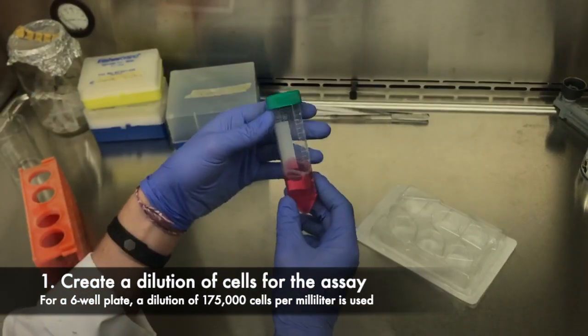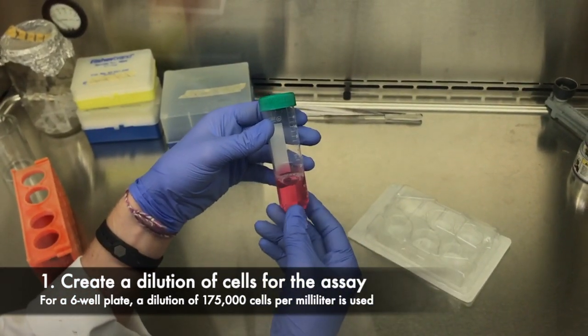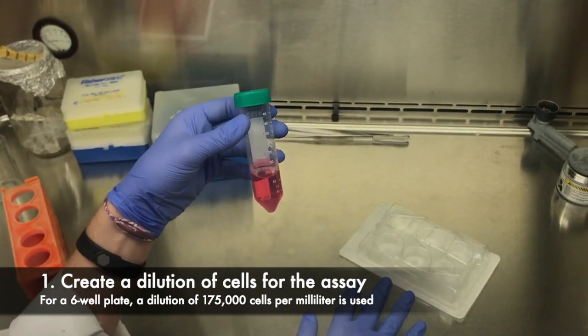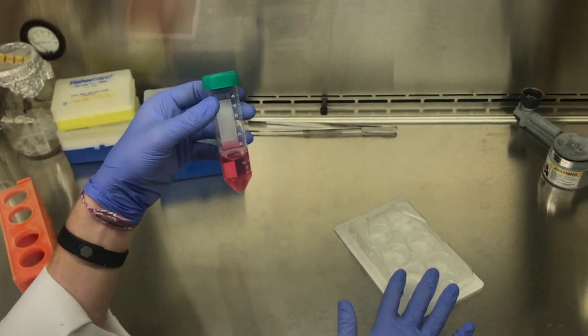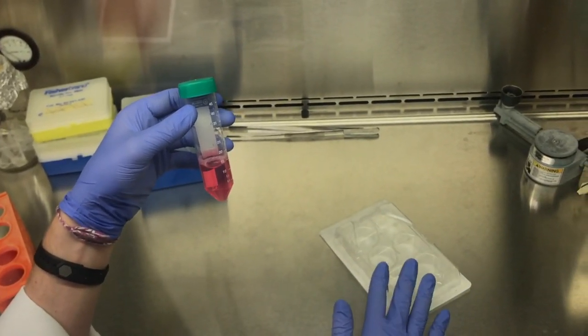The first step is to create a dilution in your normal media — whatever you would normally plate your cells in. For this six-well plate, I will be doing a dilution of 175,000 cells per milliliter. For a six-well plate, you will plate two mils of media per well for whatever cell line you're using, and you can cater it to whatever you need.